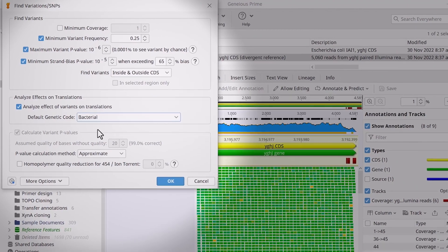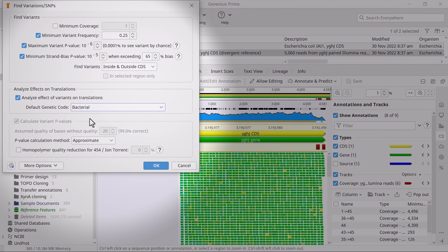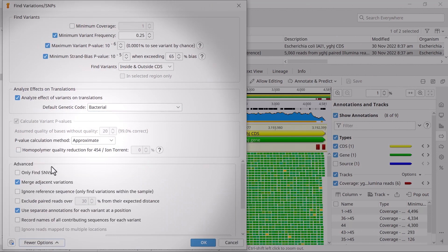In the last section, you can adjust the p-value calculation method. You can also tweak additional settings by expanding the More Options tab. Once you're happy, click OK.